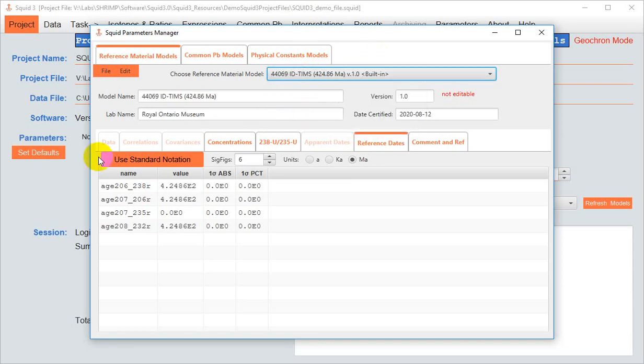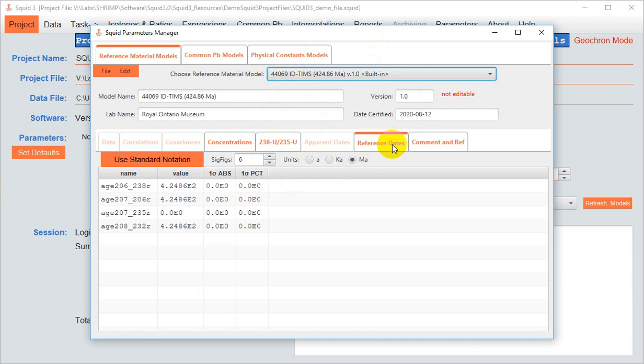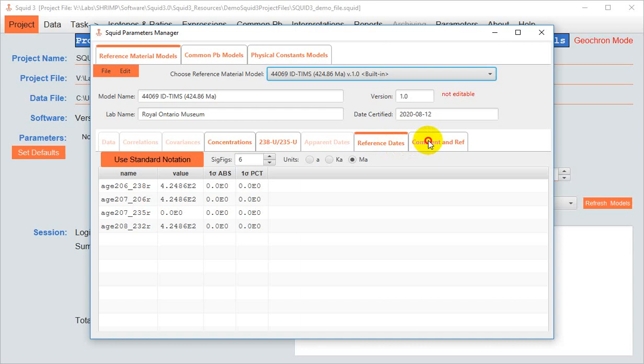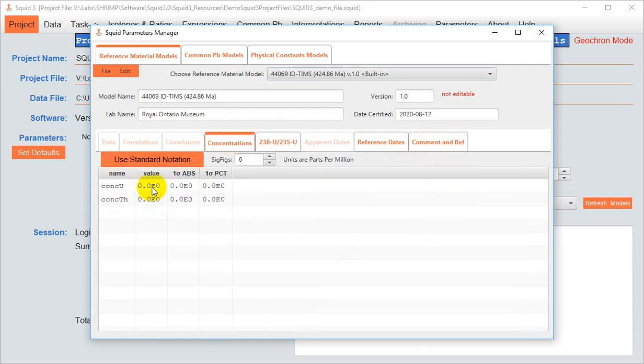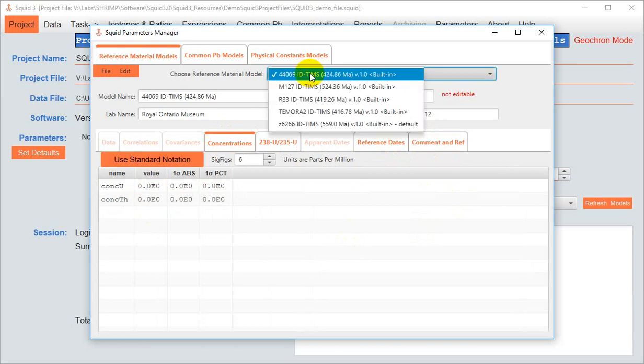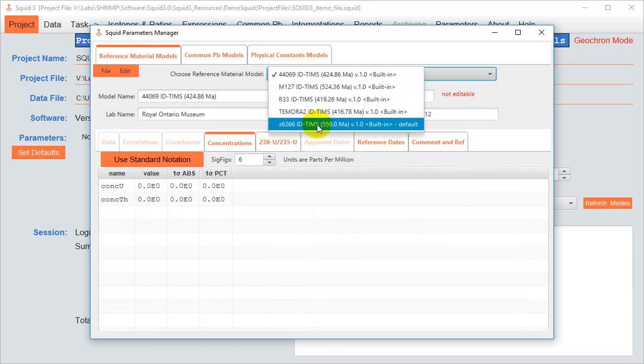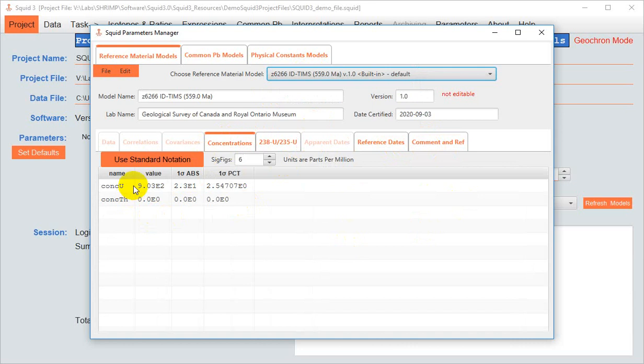The tabs at the bottom contain the accepted values for this reference material, be they concentration information, the natural uranium abundance ratio, or the accepted or published dates, along with a comment tab that contains the citation. A reference material model might contain concentration values if it's homogeneous and commonly used to calculate concentrations in unknowns, or it might be blank.